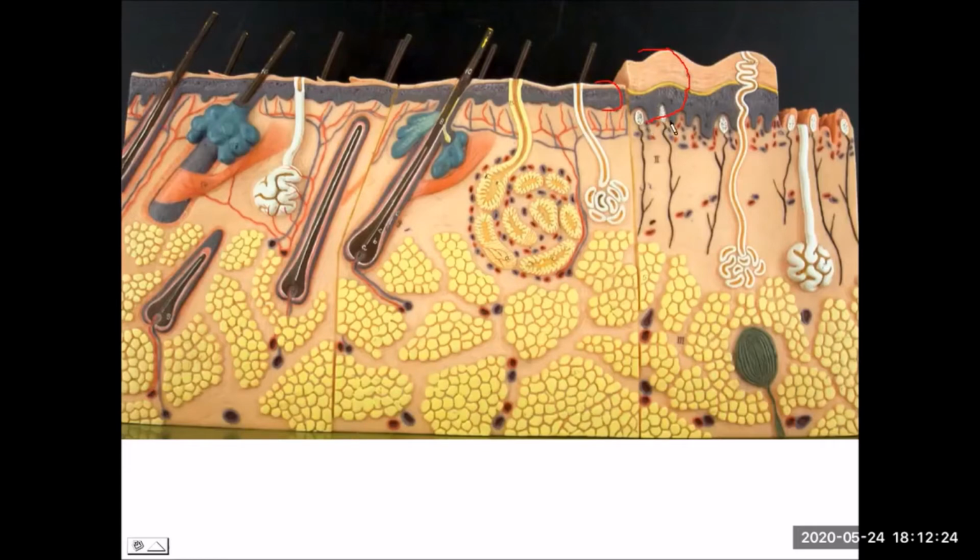And then now the second layer of the skin. Here's now where we have the dermis. And now moving beyond those two layers, here where you see all the yellow representing adipose, this is the area of the hypodermis or subcutaneous layer.